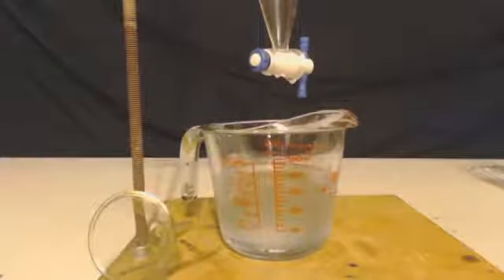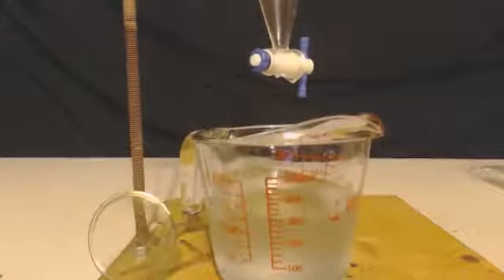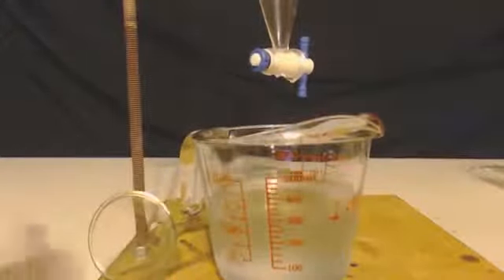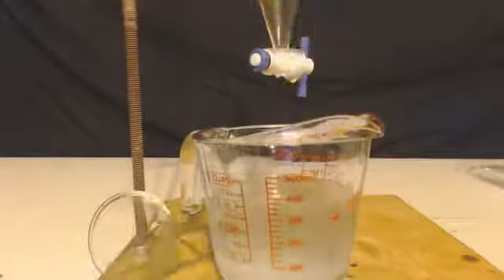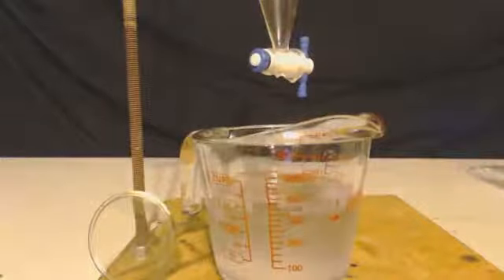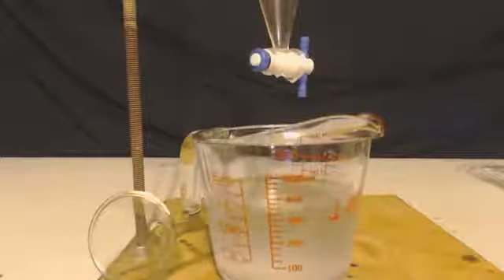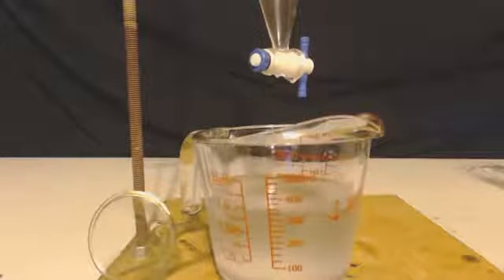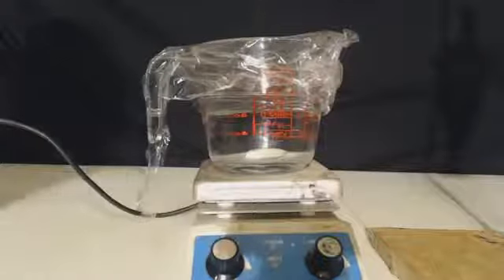Now I'm going to get rid of the trace water molecules in there by adding some anhydrous magnesium sulfate, which is just Epsom salt that was dried out. I'm going to let that sit inside there. I'm going to stir it up first for about 15-20 minutes, and then I'm going to let it sit until everything settles down so I can see that it's a nice clear liquid with no particles floating in it. Look how crystal clear that is. That's like water.